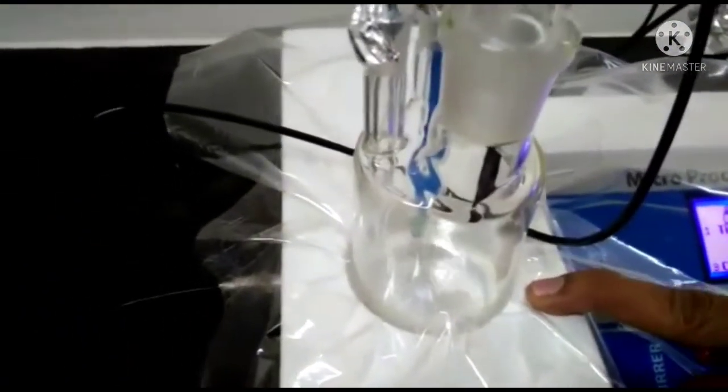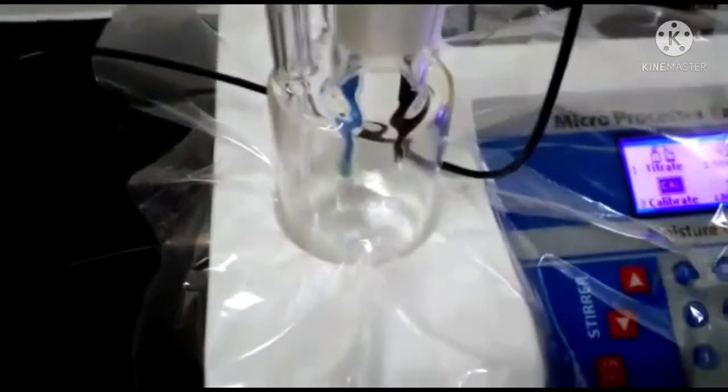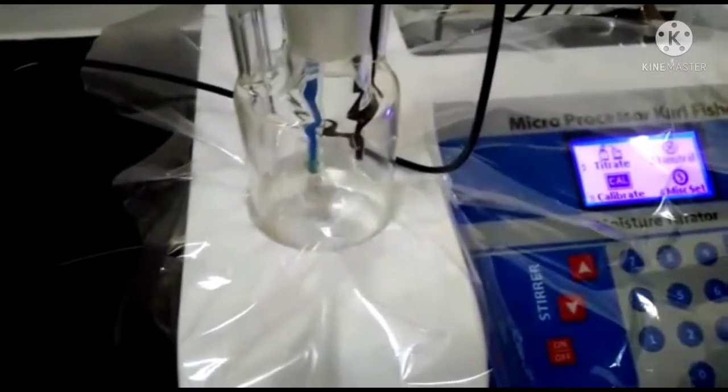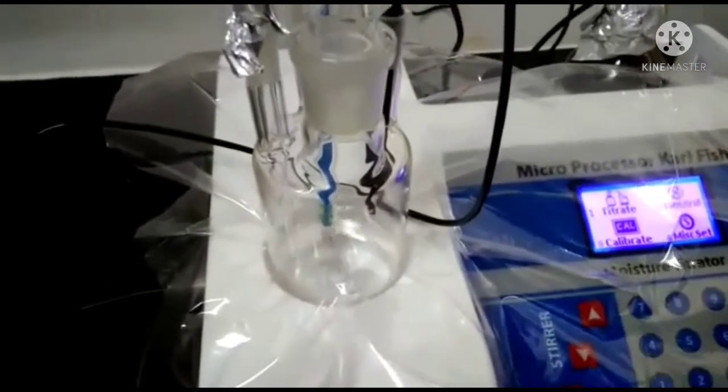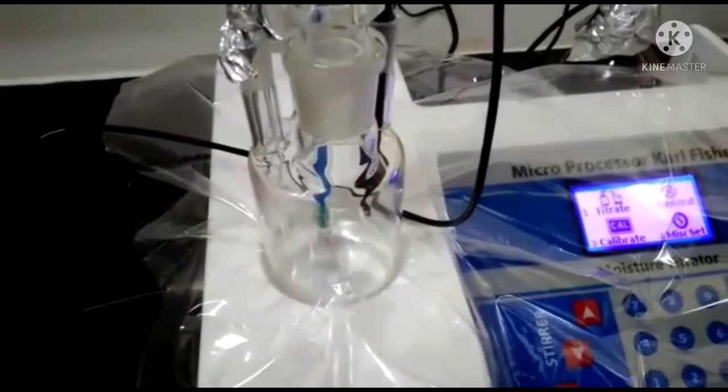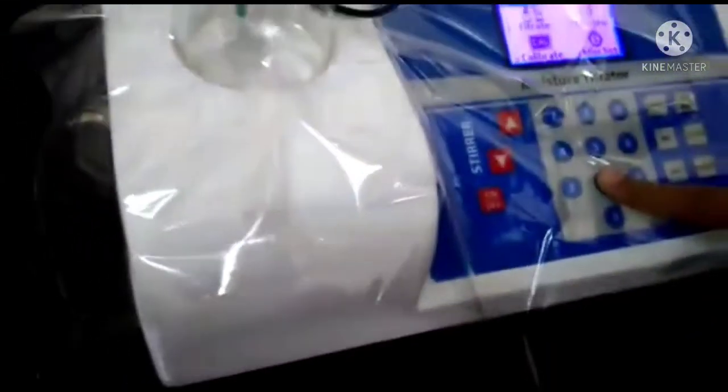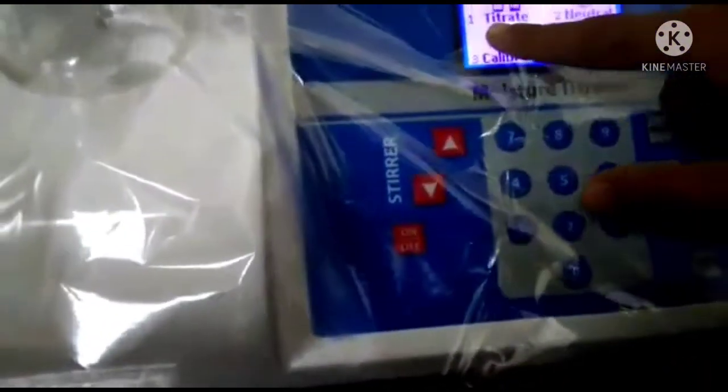So basically I have filled dried methanol inside the titration vessel and I just started the stirrer. We have to wait for a little bit around 30 seconds to let it stabilize and after that first we have to go for the neutralization to neutralize the methanol.